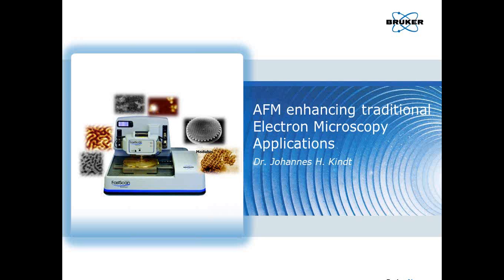After over a decade in AFM research and technology development, I am quite excited to see the AFM take its place between the established high-resolution microscopy techniques. This is driven by the AFM's traditional strengths of high-resolution imaging and 3D metrology in different environments, combined with recent advances in quantitative mechanical property mapping, imaging speed, and ease of operation.